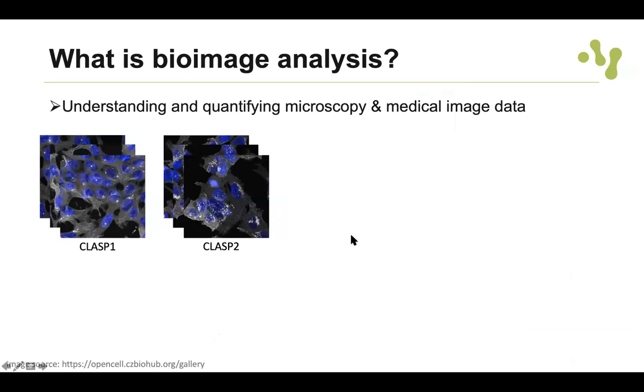So starting with the concepts now. What is bioimage analysis? How can we define it? I'm used to say that it's the process of understanding and quantifying microscopy and medical image data.